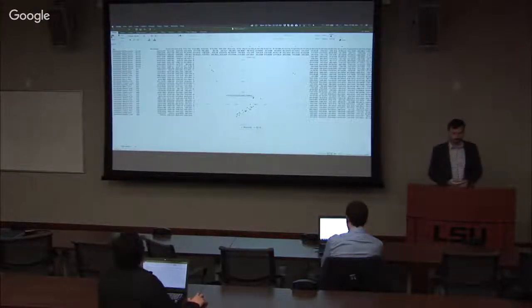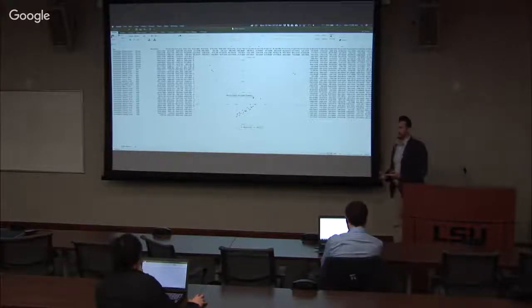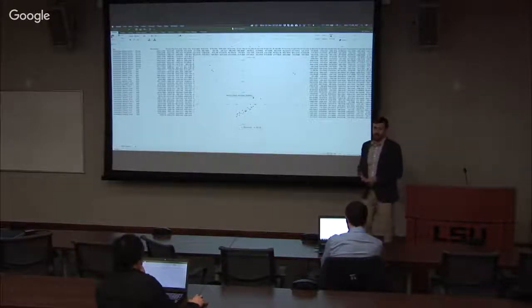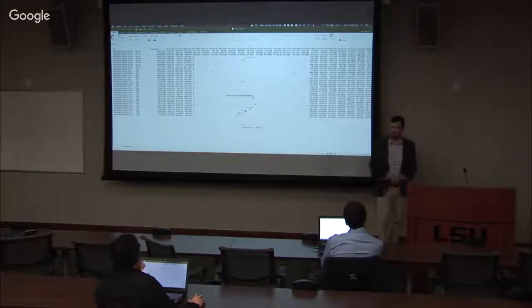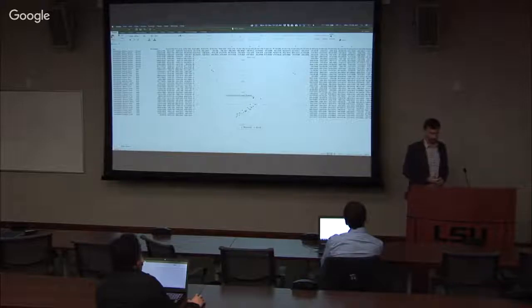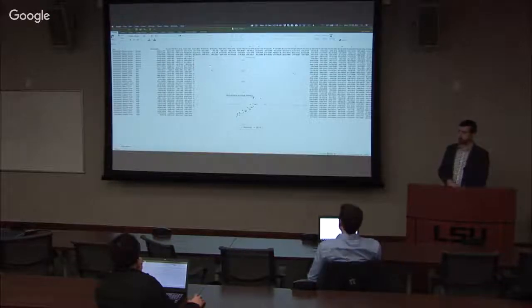What it means is that there is some variability in the data that can confuse me. If I don't have the clinical annotation of what these samples are, just by looking at the data, I will come to wrong conclusions. And so you can now see, let's go back to the normalized data.